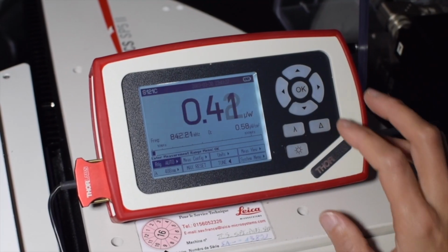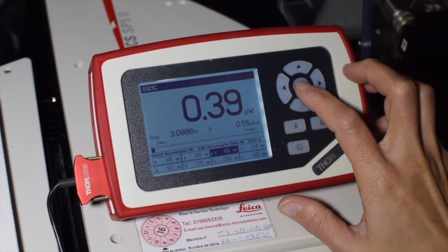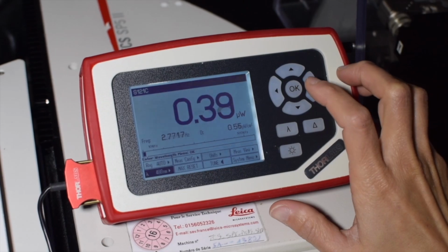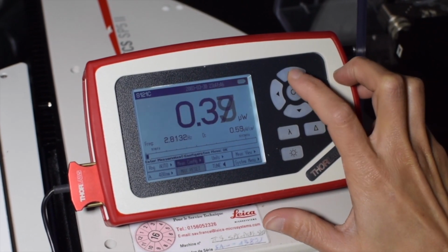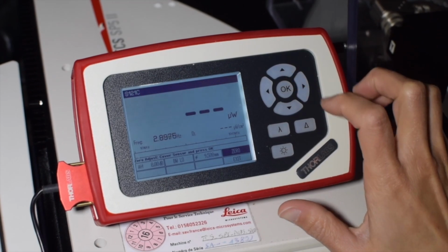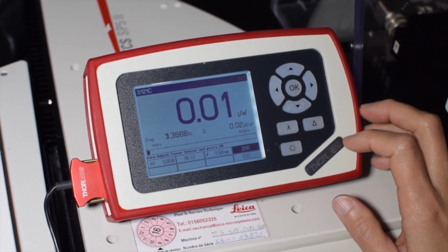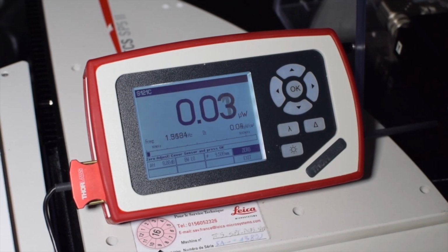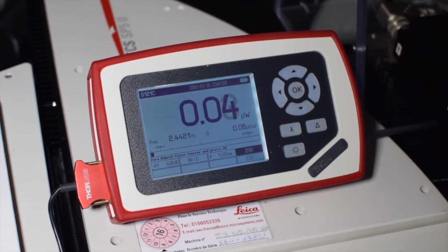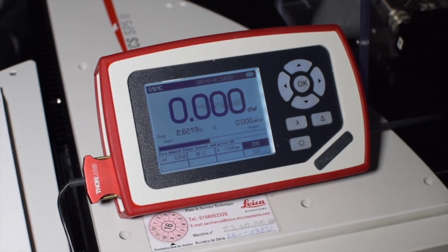Before any measurement, identify the excitation wavelength of your laser or light source. For a monochromatic laser, you need to indicate the exact wavelength to measure, for instance 488 nanometers for your argon laser. For a non-laser source, such as LED or lamps, you have to put the wavelength peak value of the excitation filter. To display the measurement correctly on the power meter, we opt for automatic adaptation of the power scale. Proceed by registering the zero reference signal under dark room conditions.